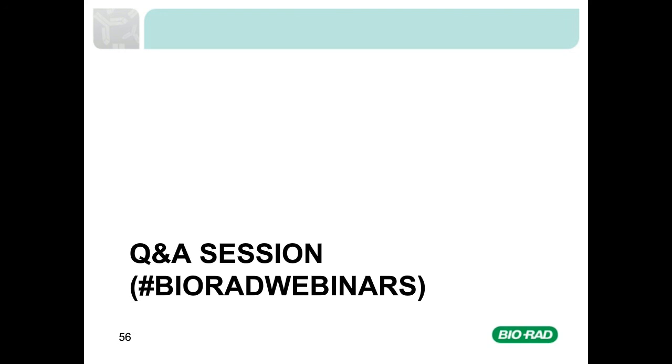For example, I've heard of people washing their beads in a urea CHAPS buffer after the elution into SDS-based buffer in order to ensure complete elution of their target protein. This was prior to 2D gel electrophoresis and mass spectrometry. It was actually a paper by Souza et al. that goes into this in more detail, and we might mention it in the tips and tricks, actually. So it might be worth consulting this for more information.